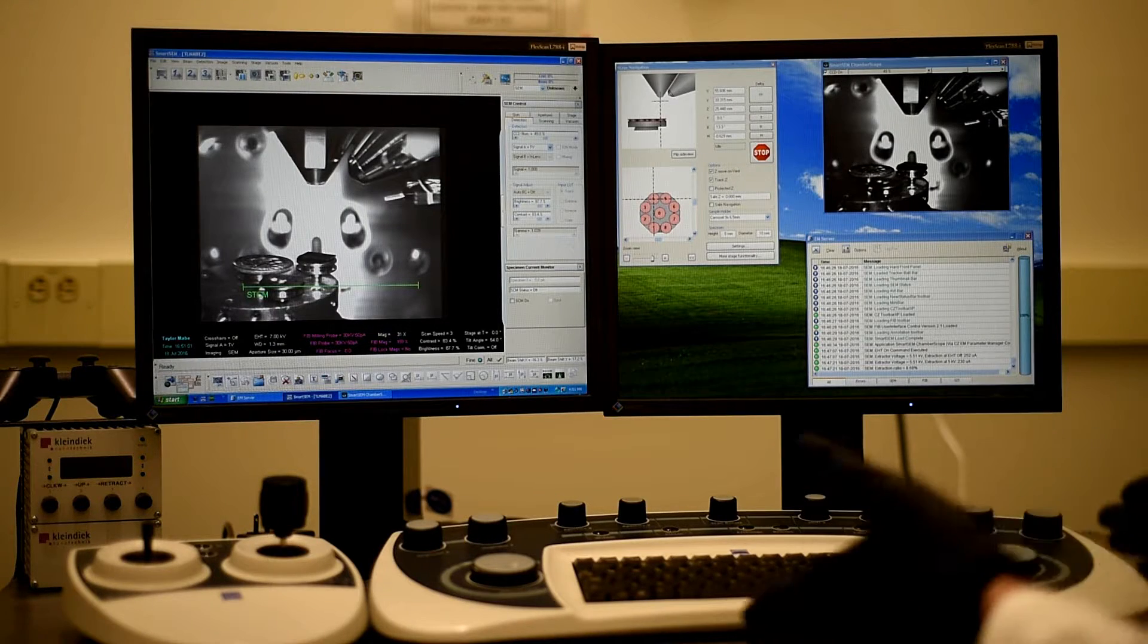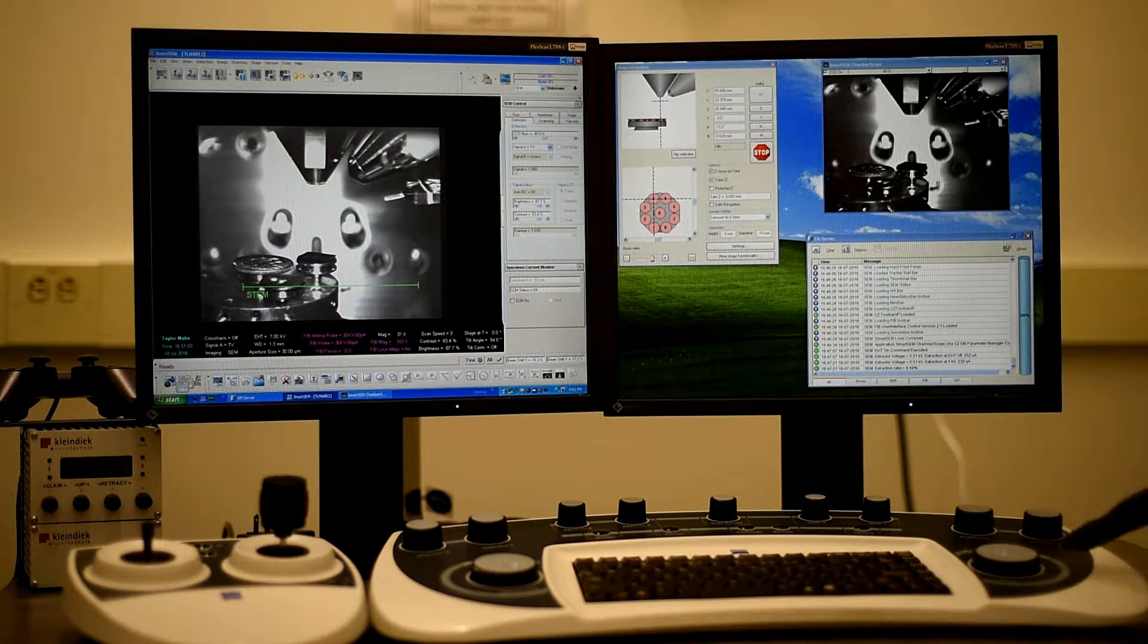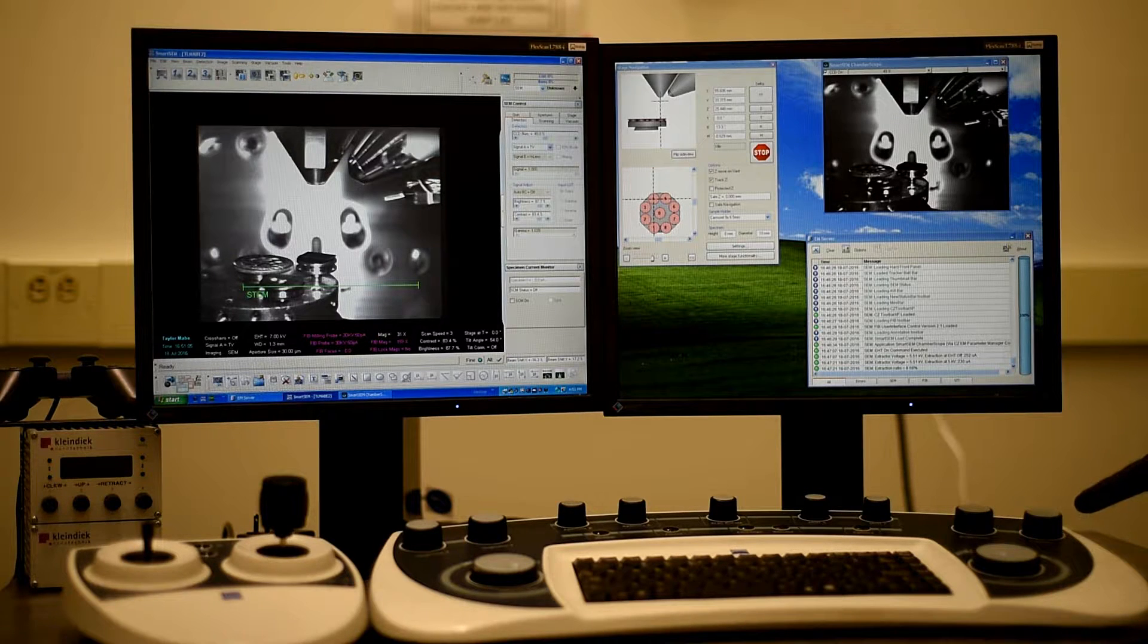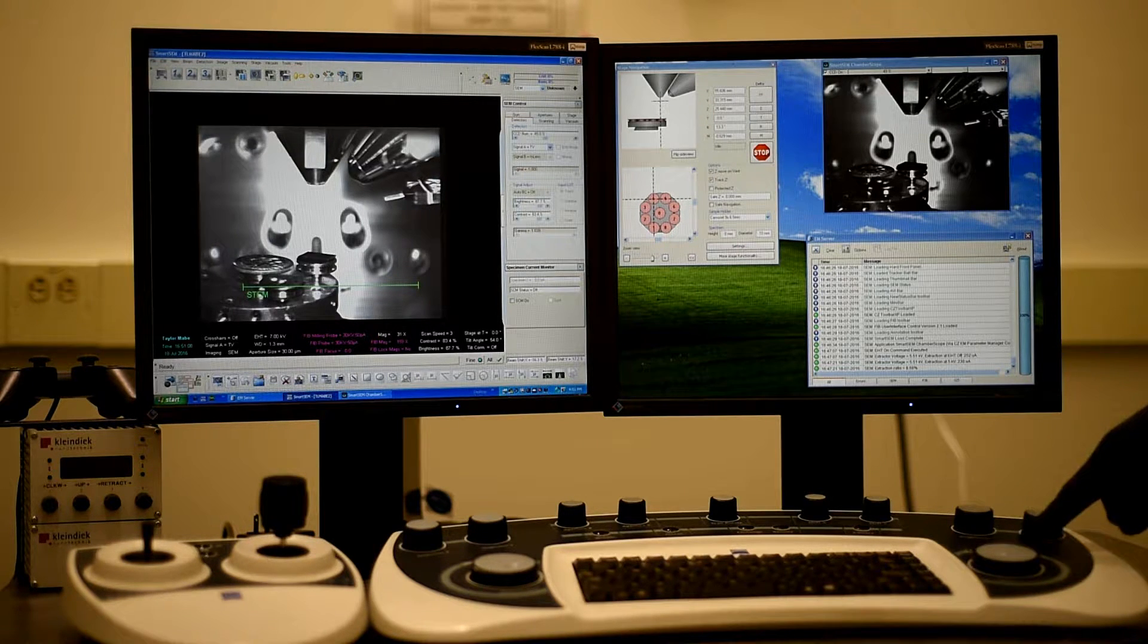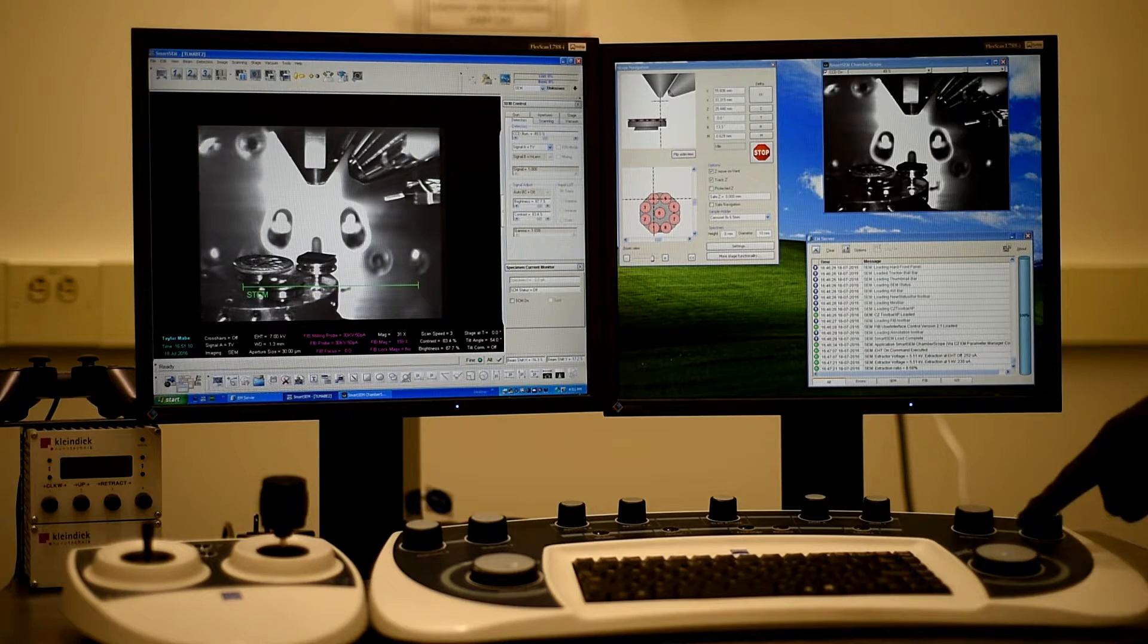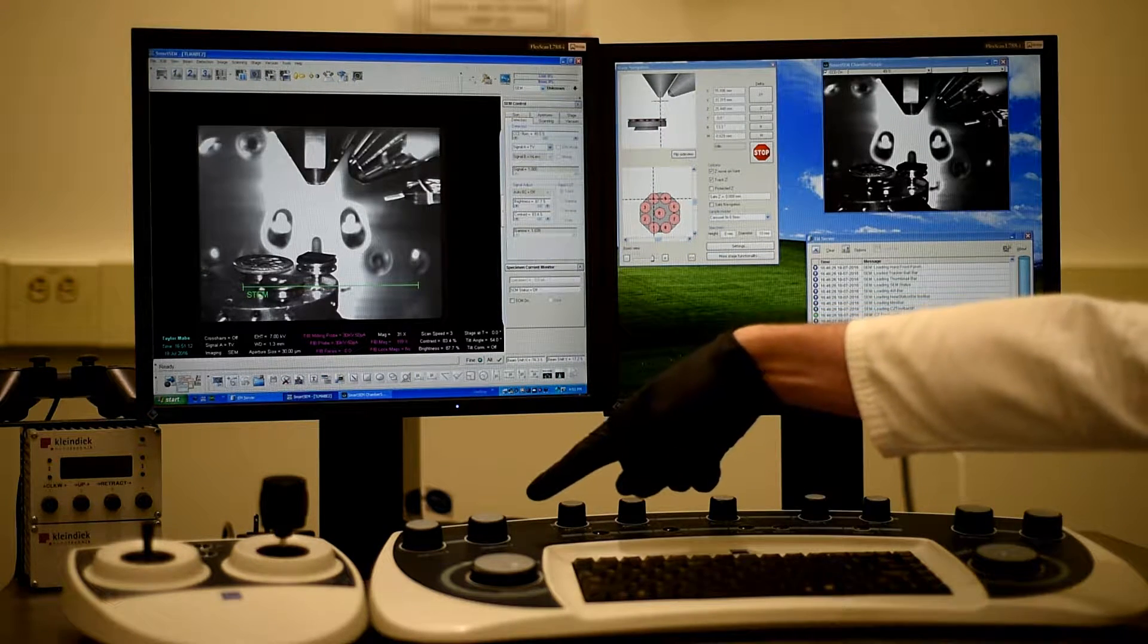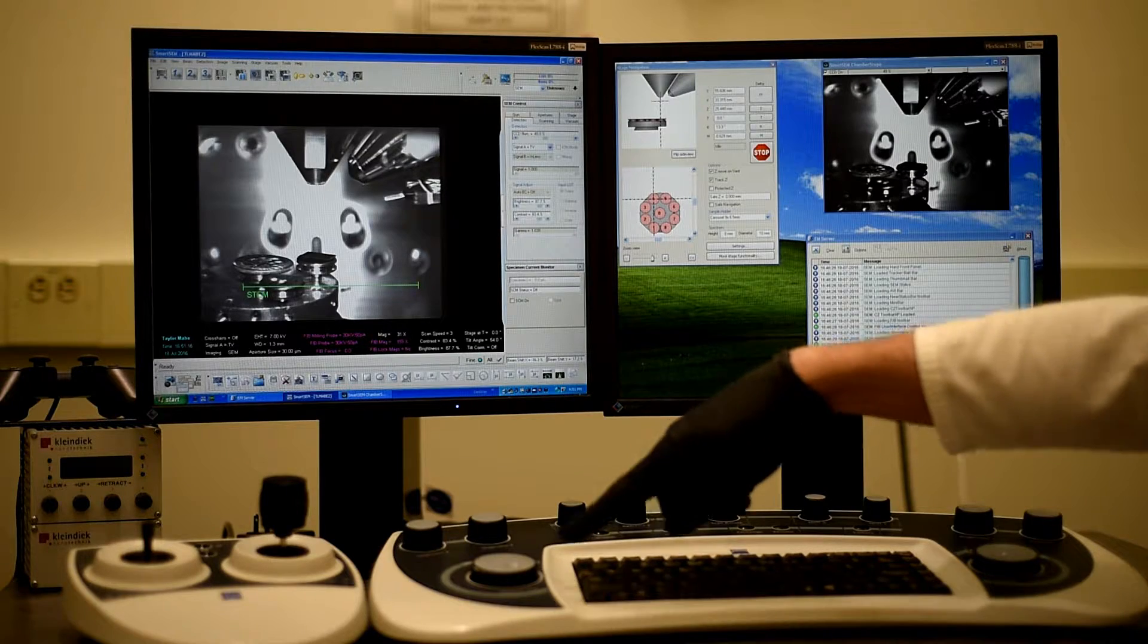As far as the controls go, the keyboard, we have the focus here, brightness and contrast. Above the focus, you can adjust the scan speed. And there's aperture control, stigmation, and there's the magnification.